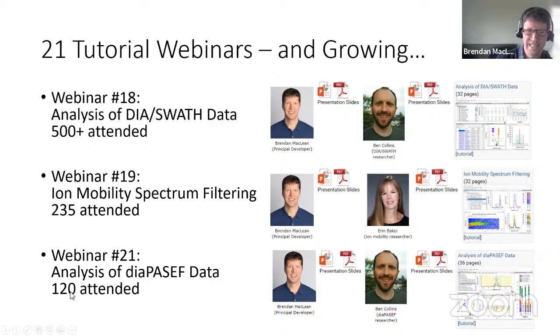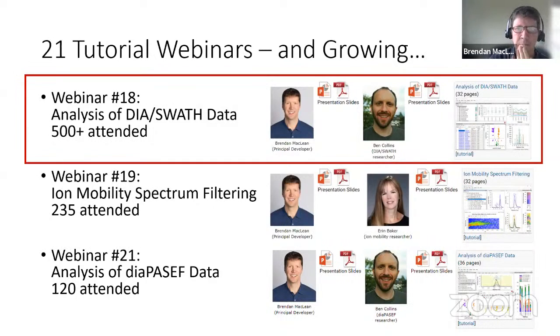And then finally, on to the timsTOF and DIA PASEF. So this was a nice little trio that I envisioned. We did eventually get there, but you can see that there's a gap between 19 and 21, which we needed Ben Collins to collect DIA PASEF data and get through creating a tutorial that is the companion tutorial to the ones that were created back in 2018.